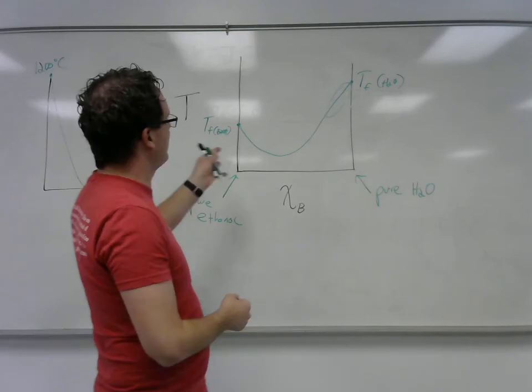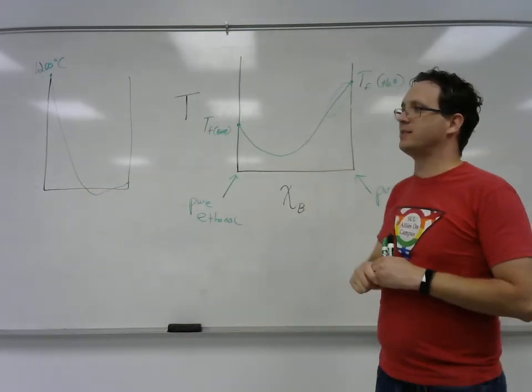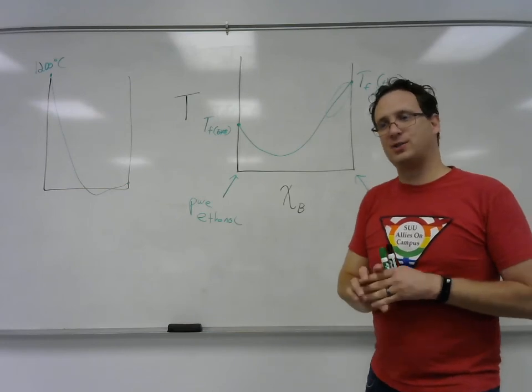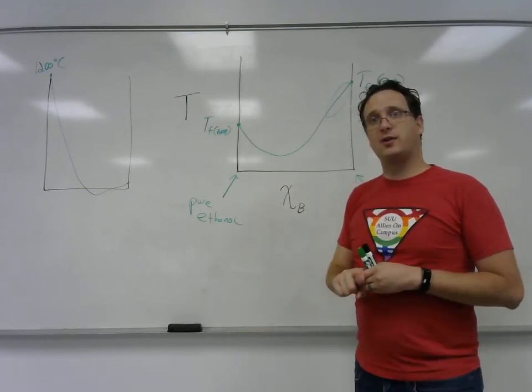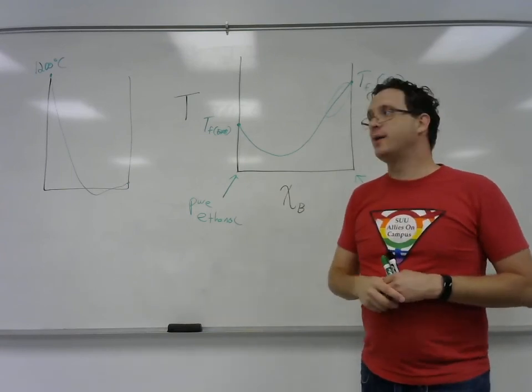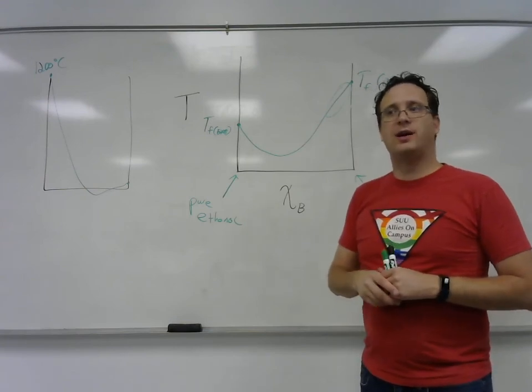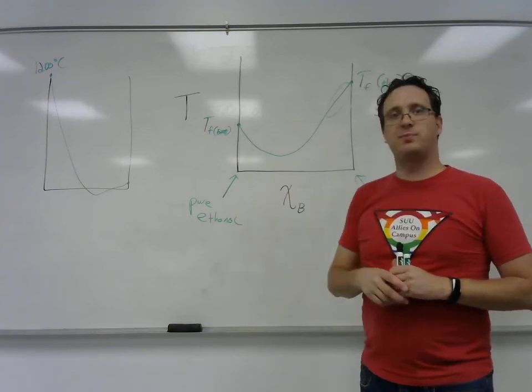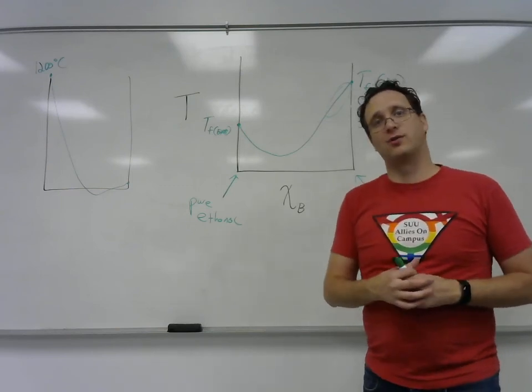In either case here, when freezing occurs, I'll find that the solvent, whatever is the majority component, has frozen out to form a more or less pure solid. And then the solute is going to be more concentrated in the amount of unfrozen solution that remains behind.